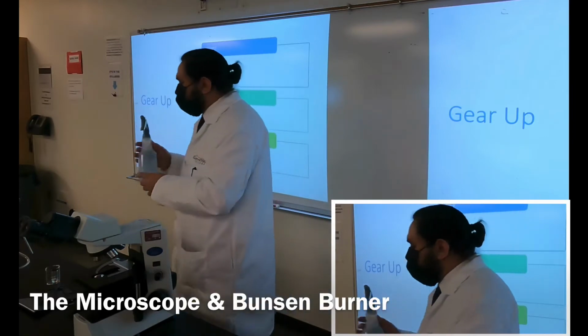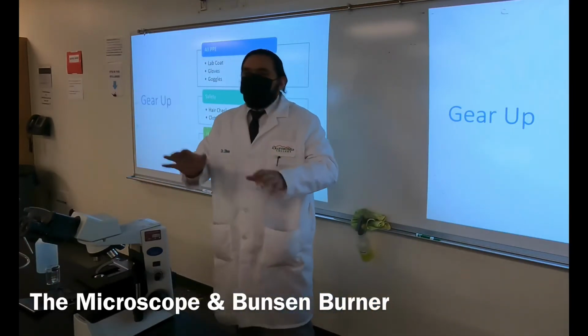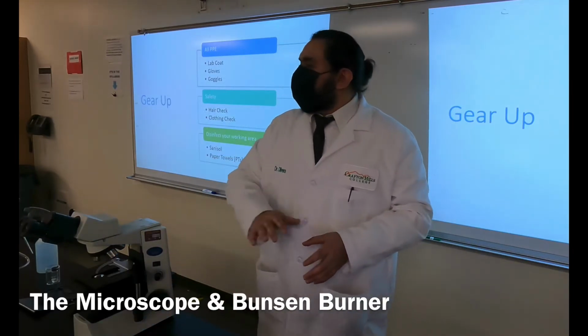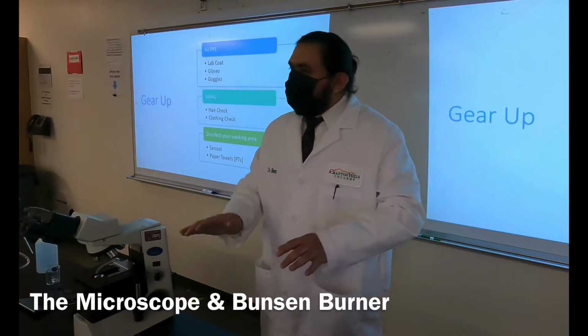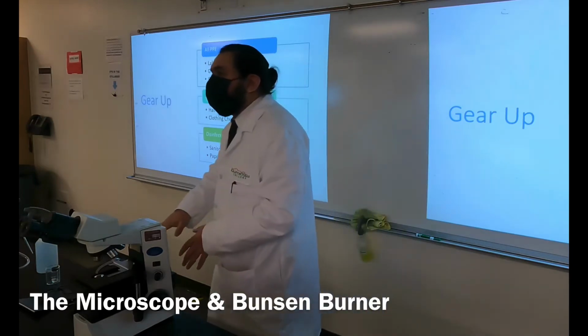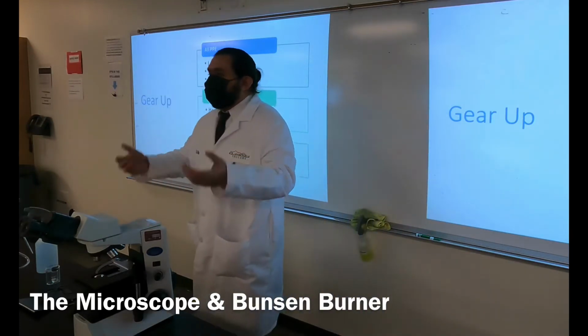It should be somewhere in the center of your bench. Spray the area that you have around you and let it sit for a small moment, and then grab a paper towel and wipe it down. Don't just hit it and wipe, because then it doesn't really work. You need to let it sit there for a little bit. Get yourself in the habit of doing that when you come in and when you leave. Disinfect before you do anything, disinfect after you do everything.